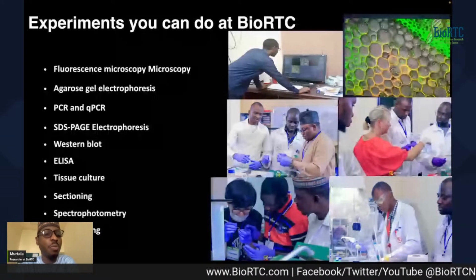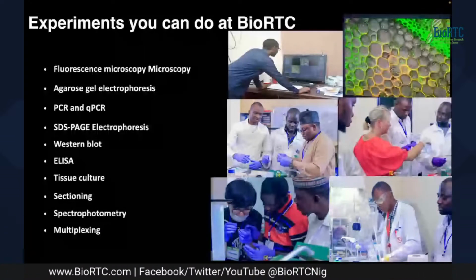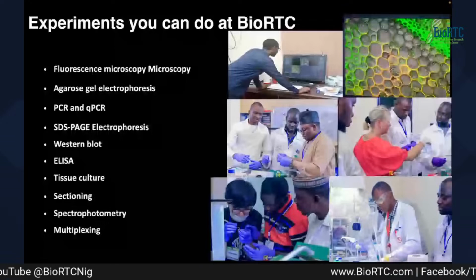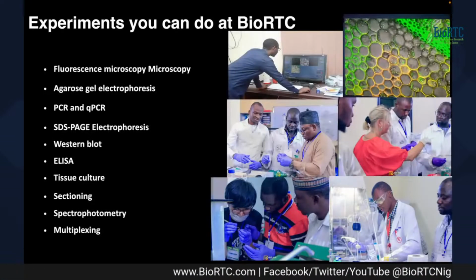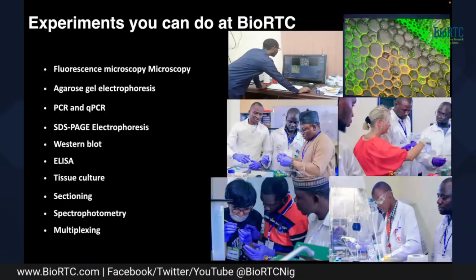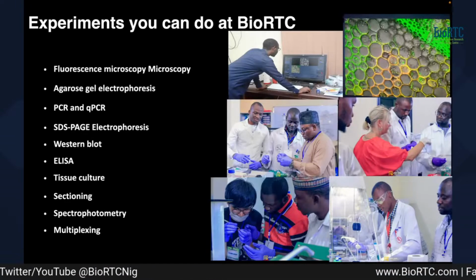Like fluorescent microscopy is one of the areas that BioRTC really has the capacity to change Nigerian and African science, because of the presence of all those microscopes that are not found elsewhere. So think about, even if you have not planned to include microscopy in your research, think about incorporating fluorescence microscopy. It's a very powerful technique. You can answer many research questions using it.